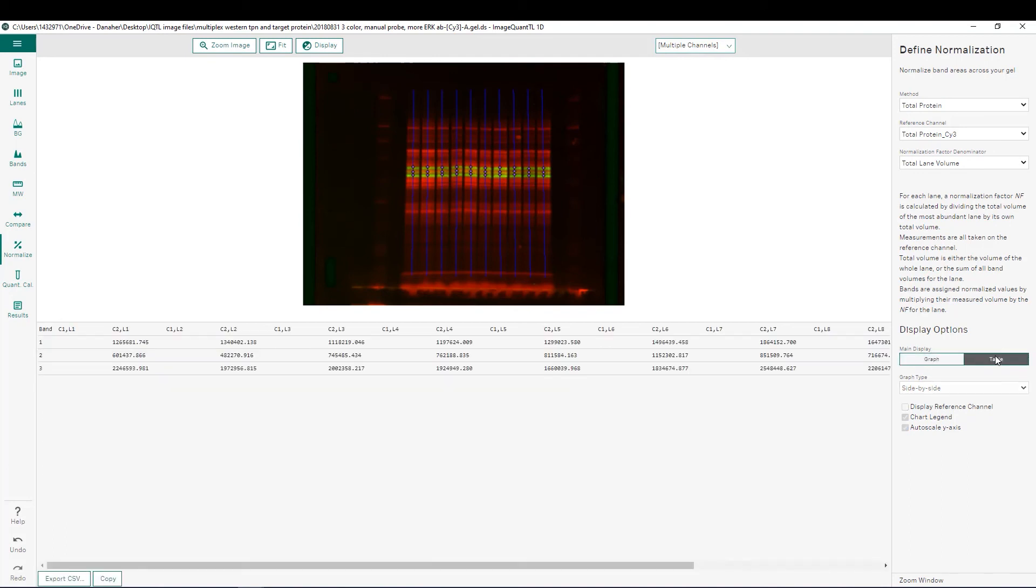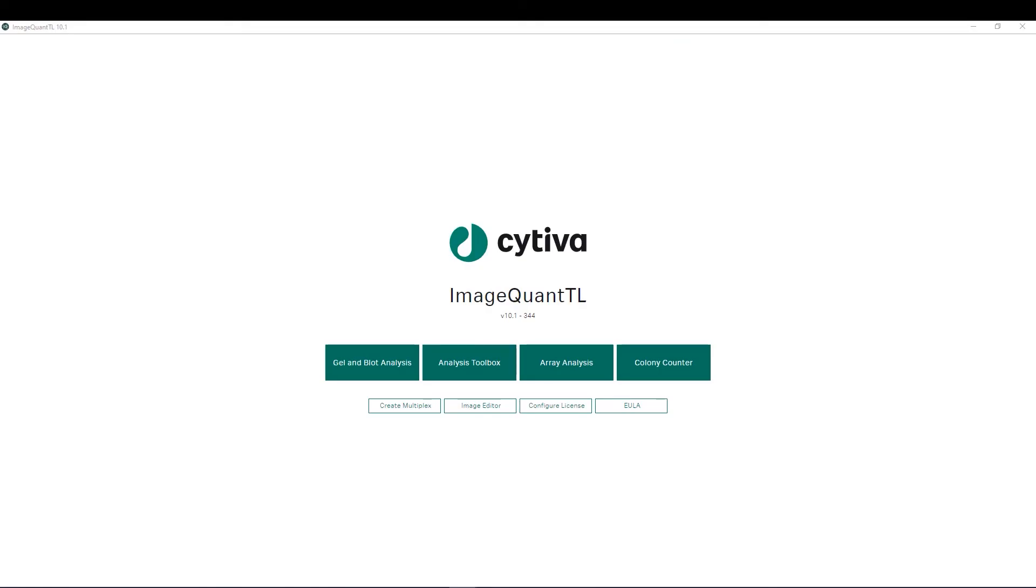In the user interface here we see both the image that's being analyzed as well as the results shown down here either graphically or you can show them as a table as well. The ImageQuantTL version 10 tutorial videos included here will provide further detail in these different types of analyses.